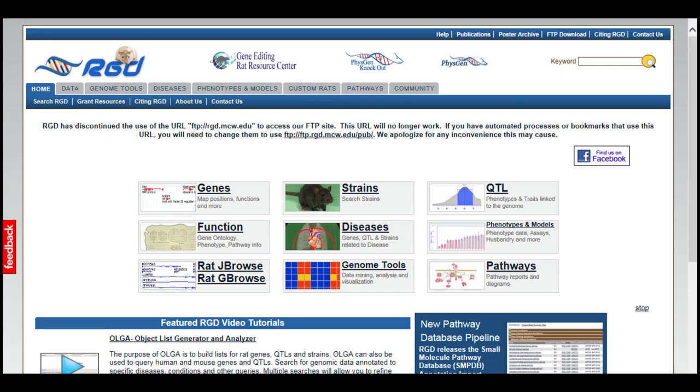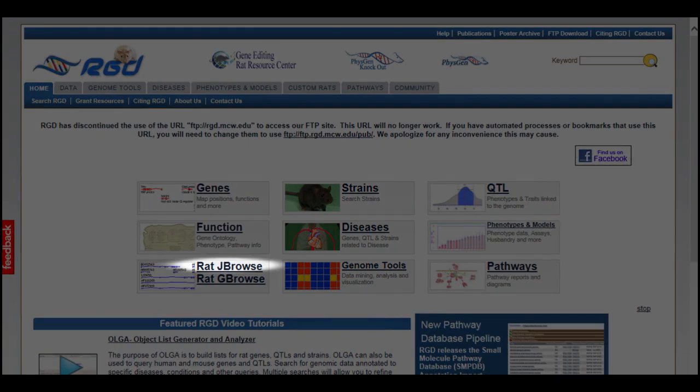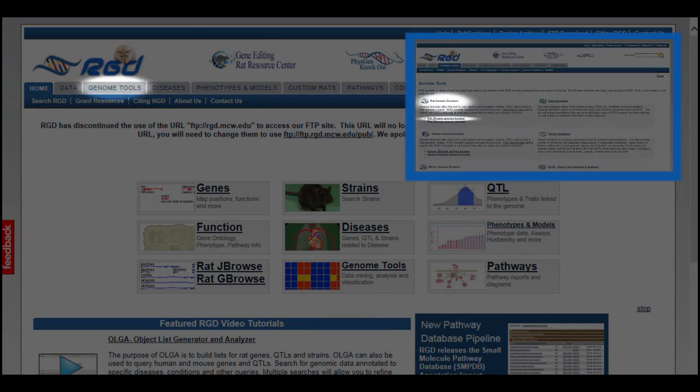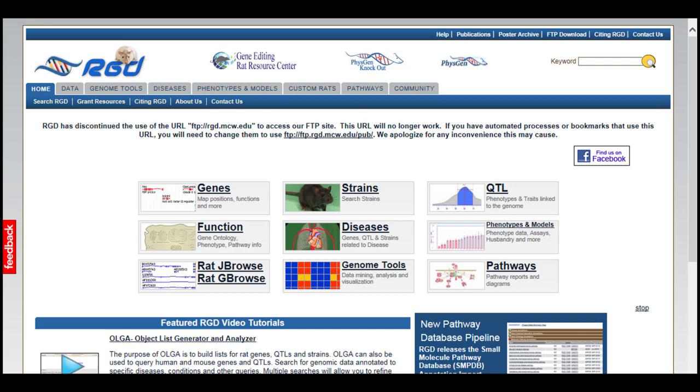This video will give you an overview of how to use RGD's JBrowse Genome browser. The browser can be accessed from the link on the RGD homepage, from the links on the Genome tools page, or from links in the position and model sections of an RGD gene page.